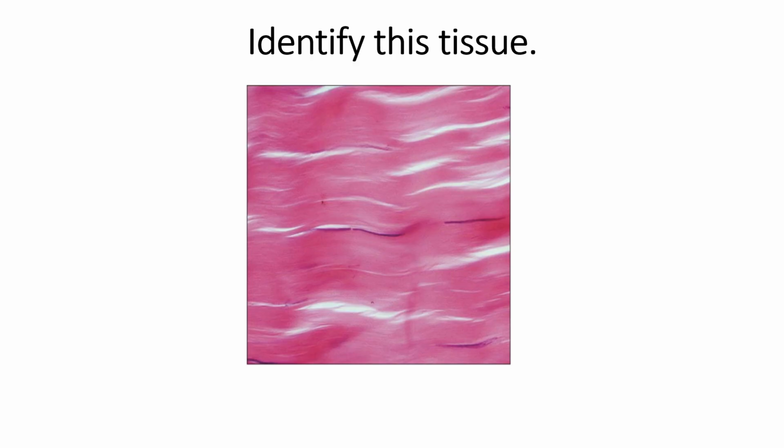Does it look like a fluid pattern to what we're looking at? So it can't be irregular. So it's either regular or elastic. Elastic is where we see those very dense fibers that are coiled and packed together. These fibers are what we're looking at here, even if you can't tell that they're fibers necessarily, they're not coiled, right? They look more kind of relaxed and fluid. So then we can settle on connective tissue proper, dense, regular.